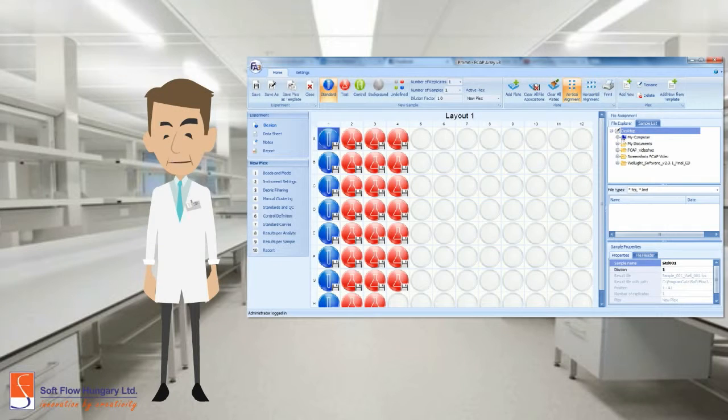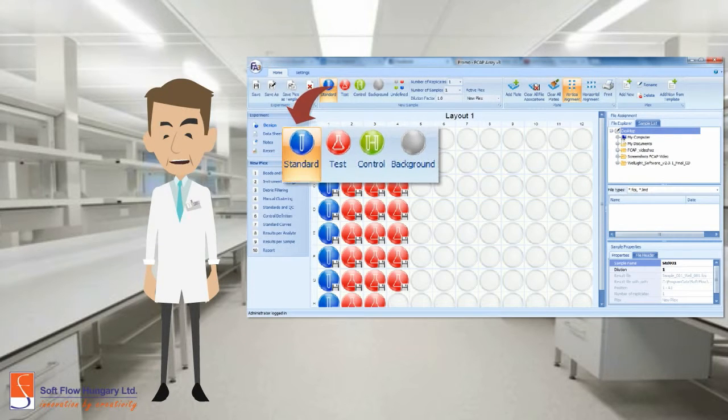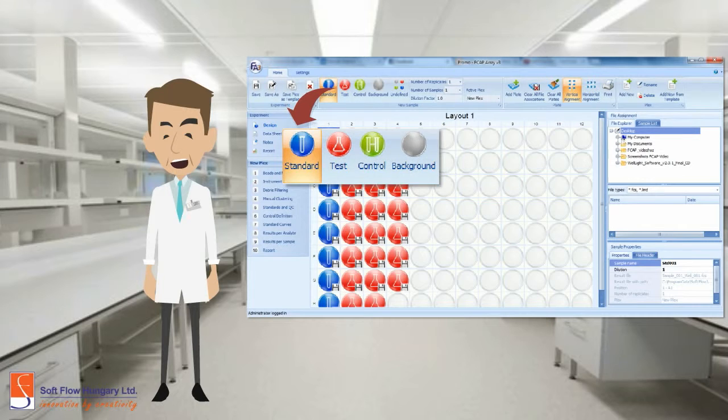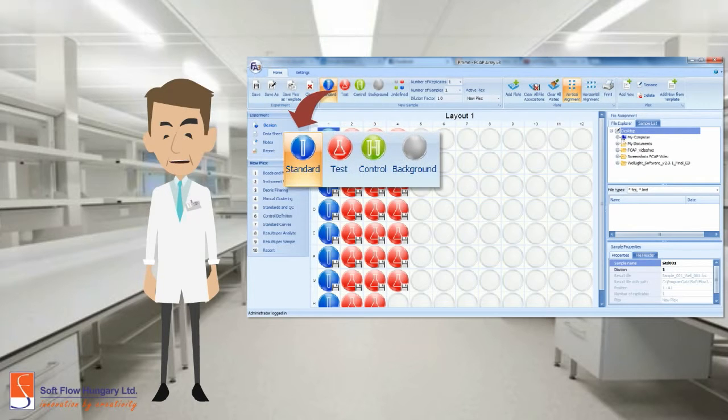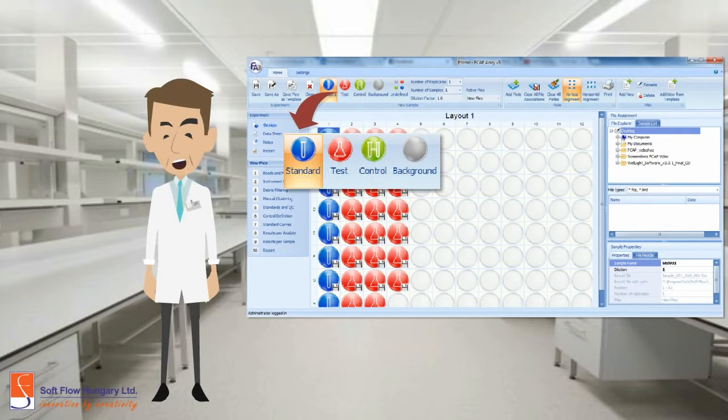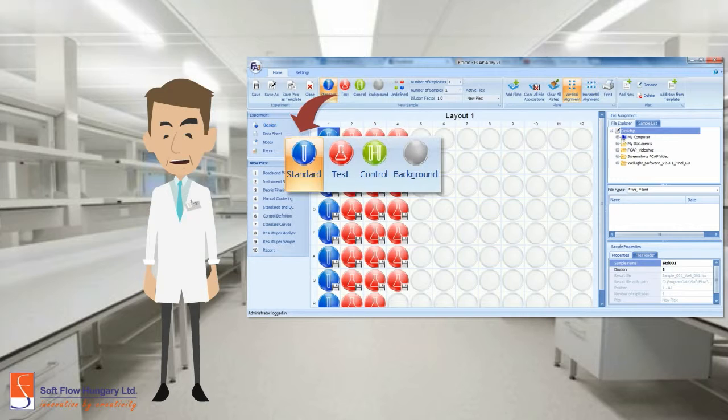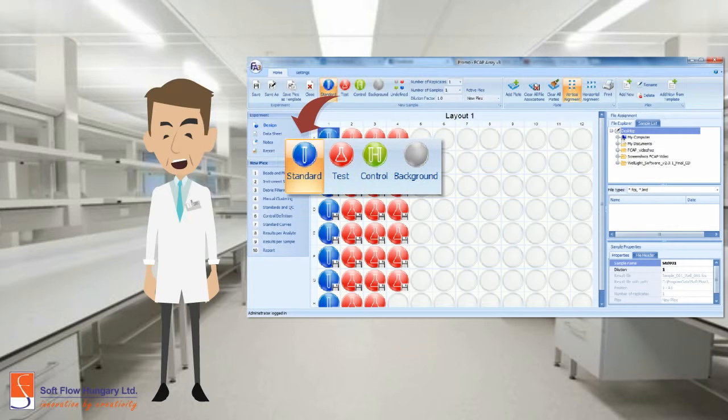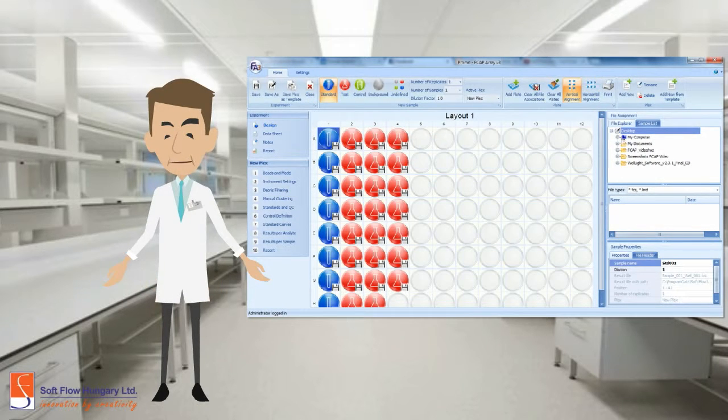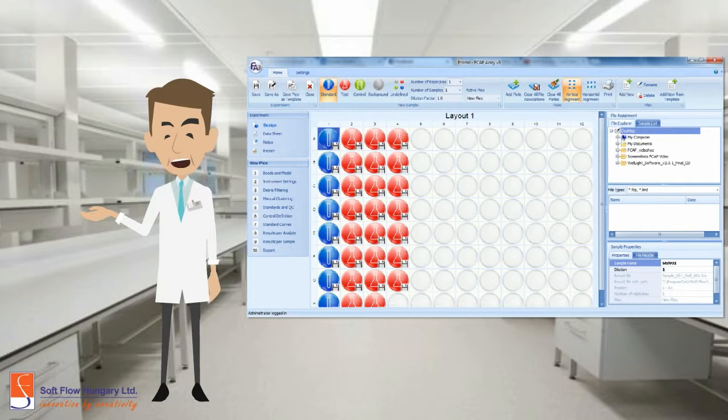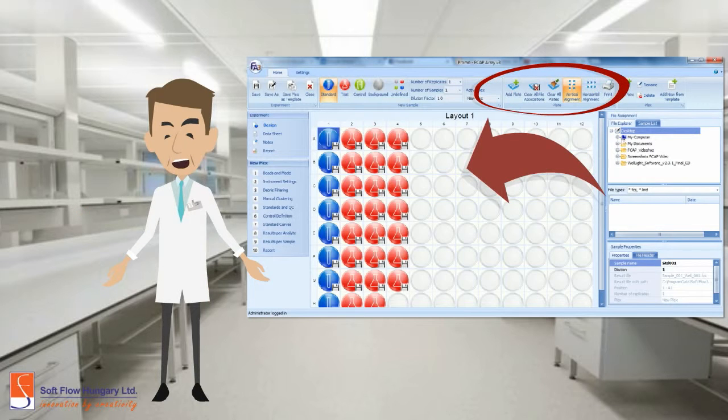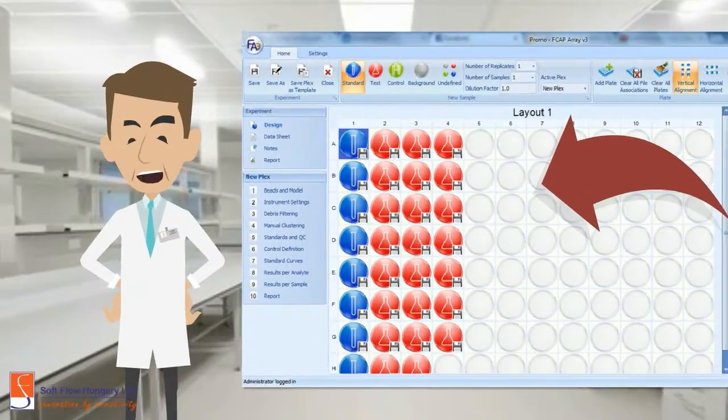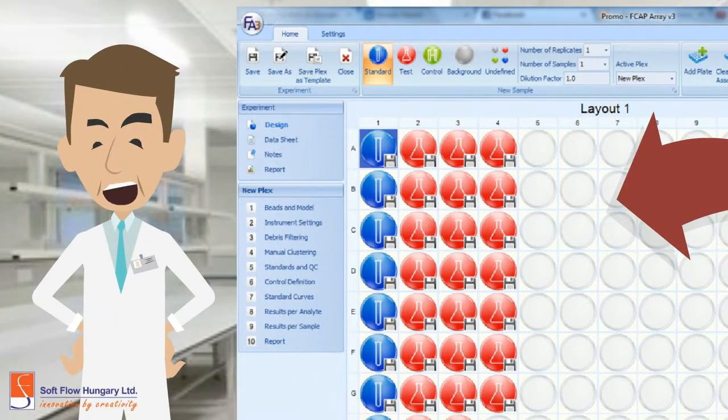Let's start with the experiment section. In the design area, you can easily design your experiment using the standards, test samples, controls, and the backgrounds. FCAP is developed in a user-friendly design. You can drag and drop the samples and define the layout you want. Feel free to add information to the data sheet and the notes.